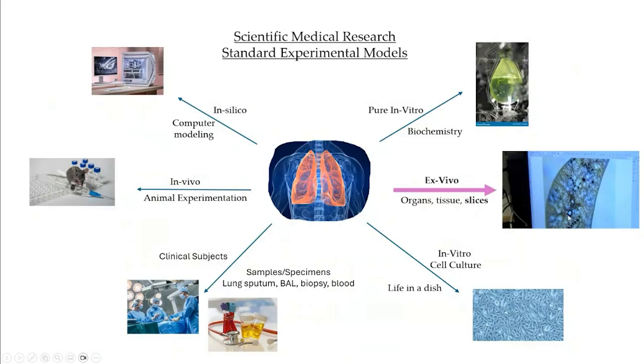And you'll see various areas of smooth muscle rings. And you'll have occasionally some blood vessels that you might see in the slice. So you have alveolar parenchyma, smooth muscle, and there'll be some epithelium here inside the smooth muscle ring. But that is essentially the area of the slice and how it looks under microscopy.